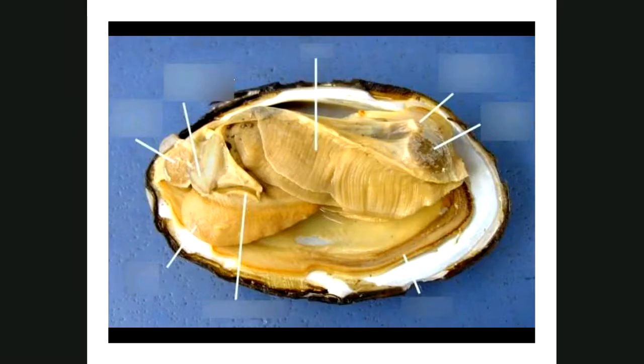So here's a picture of a real one. Here you have your adductor muscle. Let's change the color. Adductor muscle. Here's another. Adductor muscles, these are together. You have the gills.